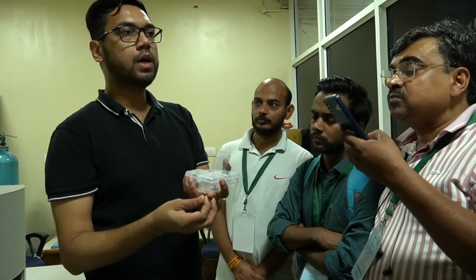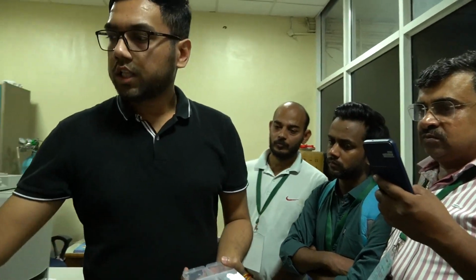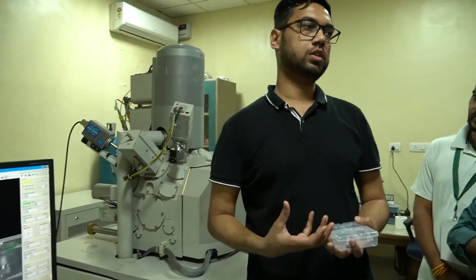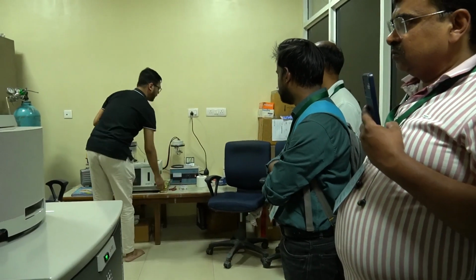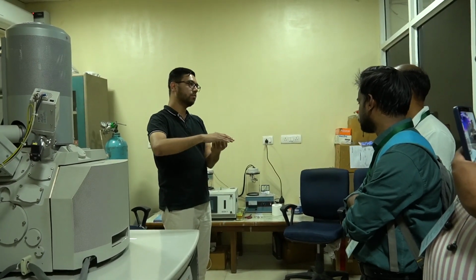Sometimes our sample is not very conductive. It has insulating properties, the surface is insulating. In that case, all the electrons accumulate on the surface, so we cannot get a perfect signal. We cannot capture those electrons. So in that case, we use a sputtering unit to sputter a conductive layer over that sample. It will generate a conductive path over the surface, and all the electrons passing on the surface will pass on towards the sample.